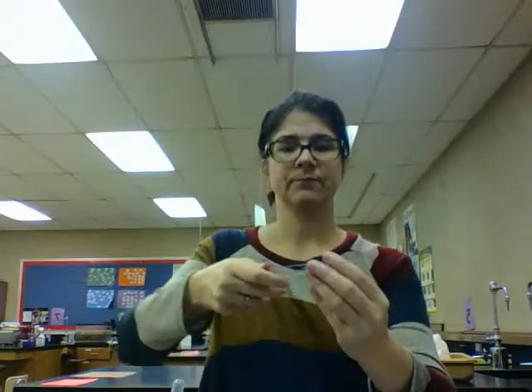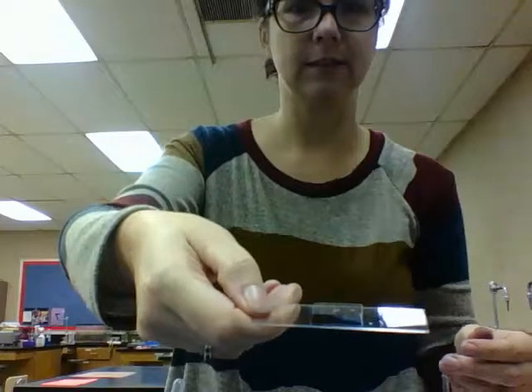Now, I will tell you too, if you're using a potato or carrot and you don't have a very good wet mount done, the stain's not going to slide through. It's going to be in the water. So if there's no water around the item that you're looking at, the stain's not going to go across it. Make sure the slide is wiped off on the sides, and hopefully you can see that there's nothing on the sides, and then you're ready to look at it.